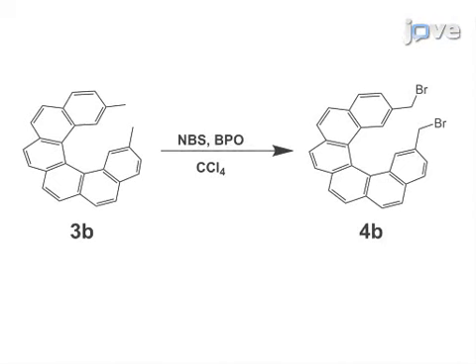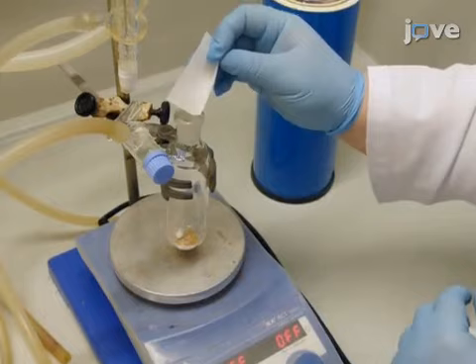To begin the dibromination, weigh 0.356 grams of 2,15-dimethylhexahelicene, 0.374 grams of freshly recrystallized N-bromosuccinimide, and 24 milligrams of benzoyl peroxide. Place all solids in a 100-milliliter Schlenk flask with a magnetic stir bar.